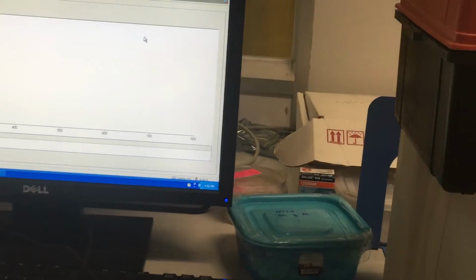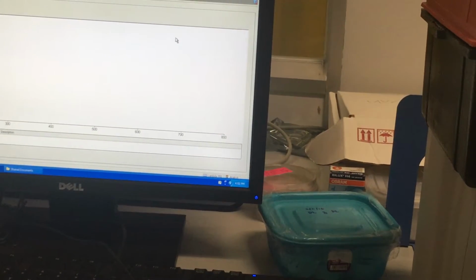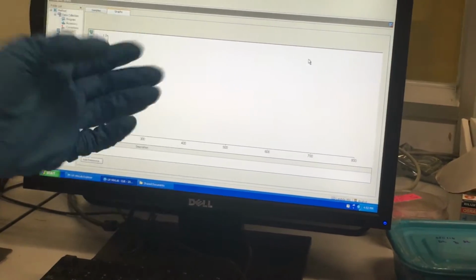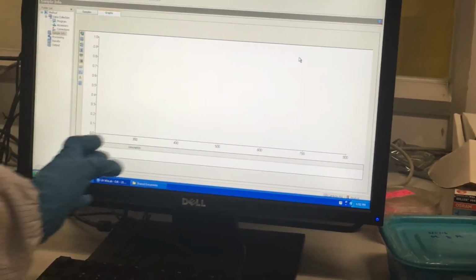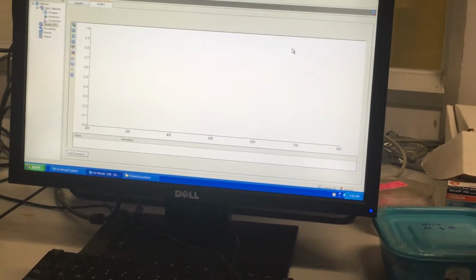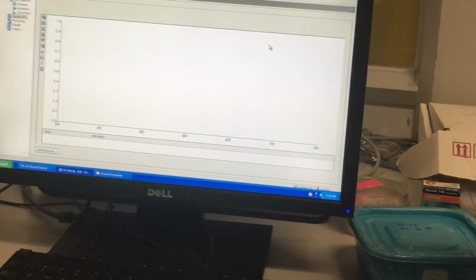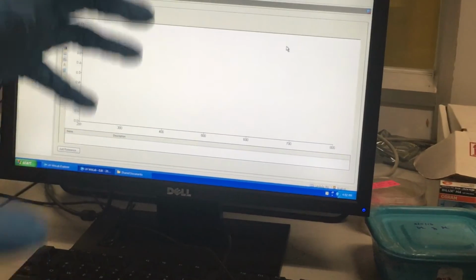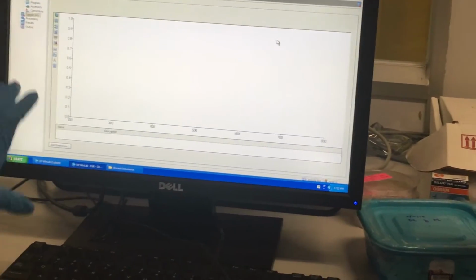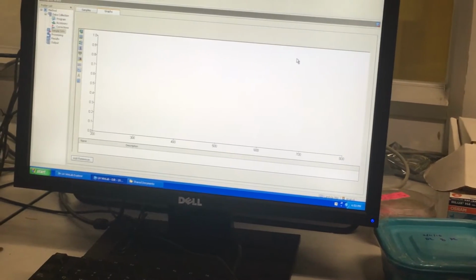Inside, it will start to split or provide the wavelength according to what we need, using the grating mirror, the beam splitter, the attenuator, and the chopper. Internally, there are many mechanisms inside. So here we are actually measuring the transmittance and absorbance.